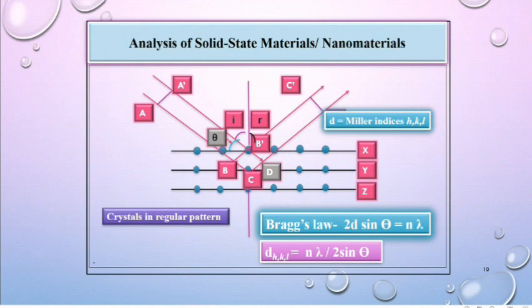However, the intensities of the reflections are determined by the distribution of the electrons in the atoms present in the unit cell. Particularly, the intensities depend on what kind of atoms we have and where in the unit cell they are located. Planes going through areas with high electron density will reflect strongly, while planes with low electron density will give weak intensities.